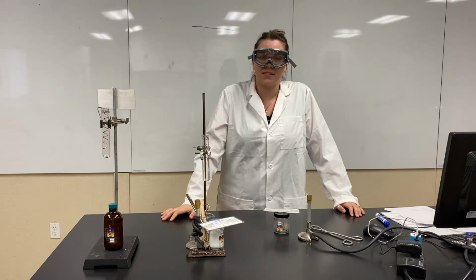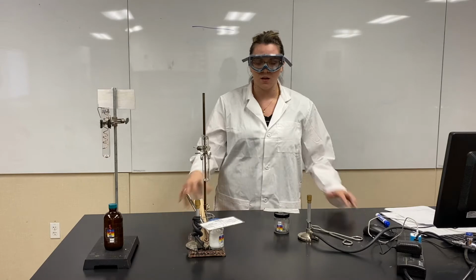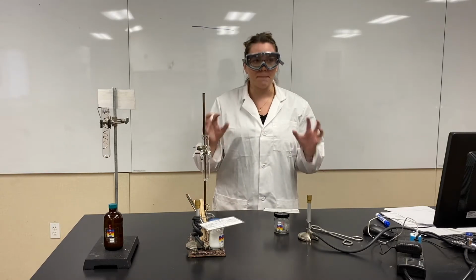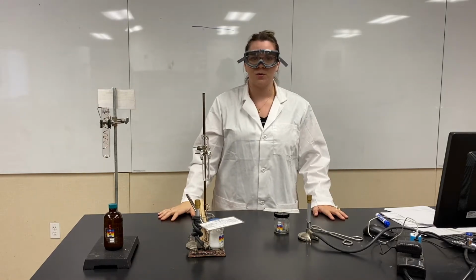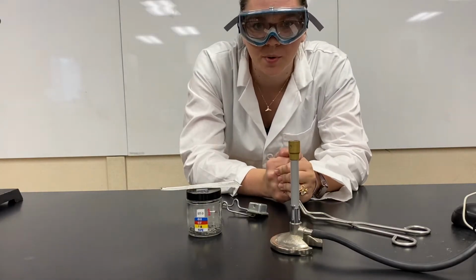All right, everyone, this is experiment 9, which is types of reactions, okay? We have a bunch of demos to look at, and we also have the many different experiments to look at types of reactions, okay? Here we go. So this is demo number 1, okay?